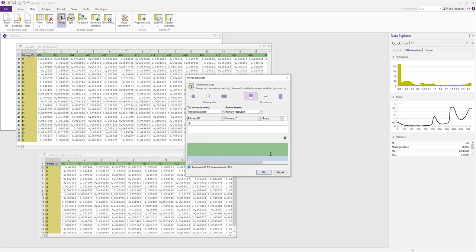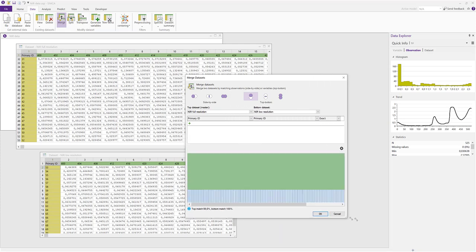In the visualization, we see that this master data set, the green, is placed on top and the lower resolution data set is placed below. If we look really carefully, we can see that the blue section only has data in every second column.